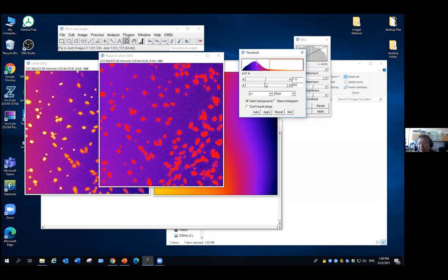So this is another way to correct the uneven illumination. It's better than the rolling ball subtraction, because we actually measured a reference image. So we can rely on this to compare the intensity of here to here. We have a physical measure of the difference. So now we can actually compare this cell here to this one. If you just use the rolling ball subtraction, you can kind of do this, but you do not have as much confidence in it.